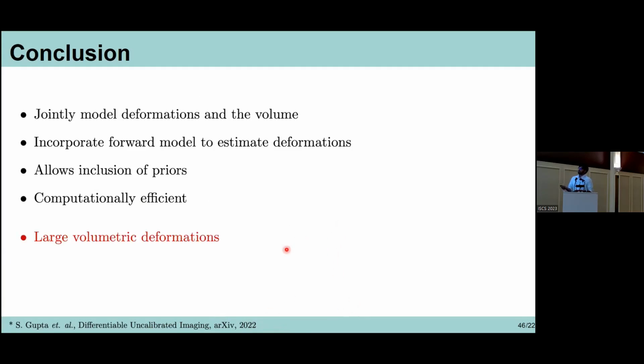However, we do not look at large volumetric deformations, which are typically present in CryoET, although current methods do not look at these deformations either. And also, we do not look at the effect of limited viewing angles.